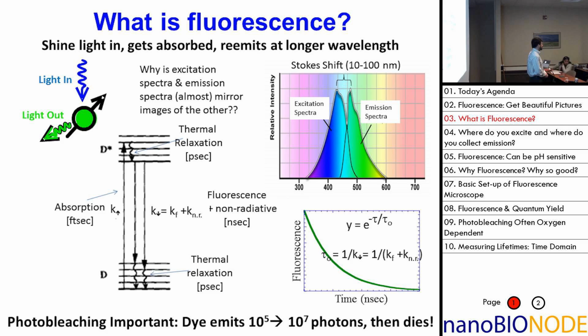Laplace and Fourier transformation along with Laguerre-Gauss expansion have been used to estimate the lifetime in transformed space. These approaches are faster than the deconvolution-based methods, but they suffer from truncation and sampling problems. Moreover, application of methods like Laguerre-Gauss expansion is mathematically complicated.